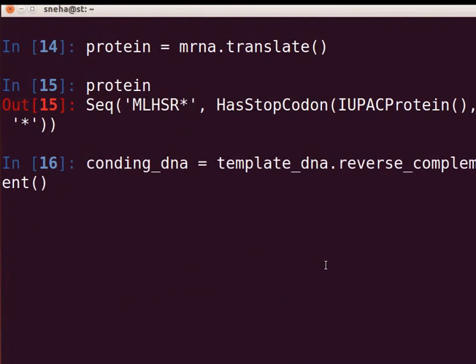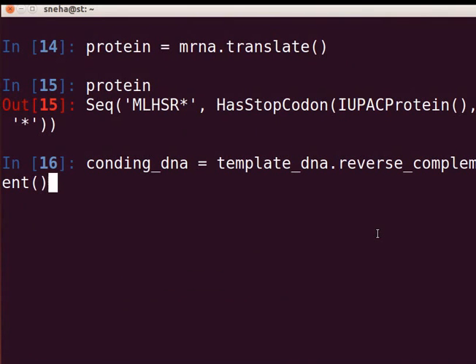In the above code, we used a coding DNA strand for transcription. In Biopython, the transcribe method works only on the coding DNA strand. However, in real biological systems, the process of transcription starts with a template strand. If you are starting with a template strand, convert it to the coding strand by using the reverse_complement method as shown on the terminal, then follow the rest of the code as shown above for the coding strand.